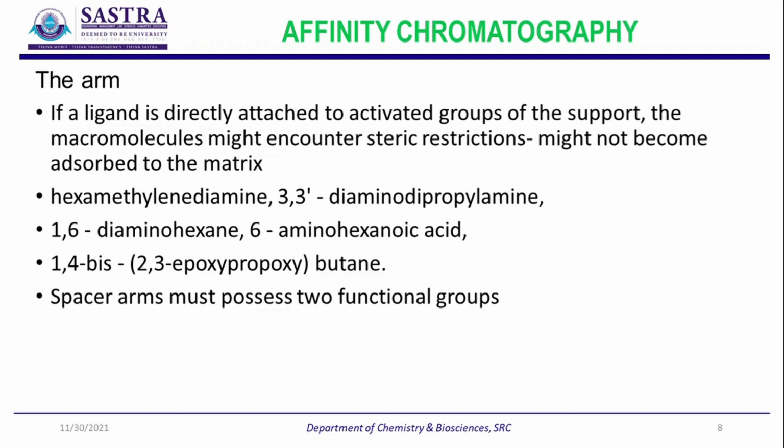If a ligand is directly attached to an activated group of the support, the macromolecules might encounter steric restrictions and might not become adsorbed to the matrix.